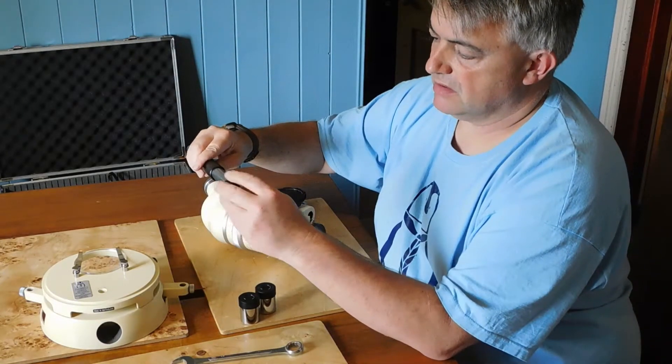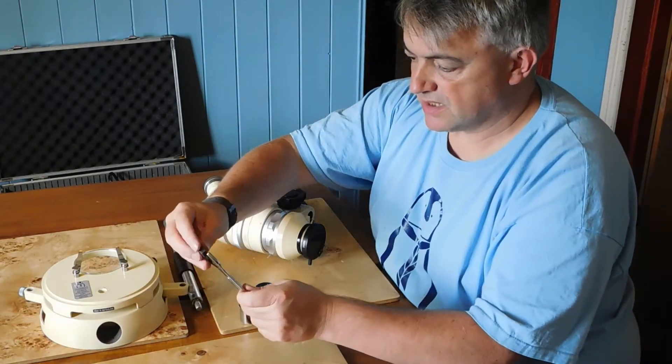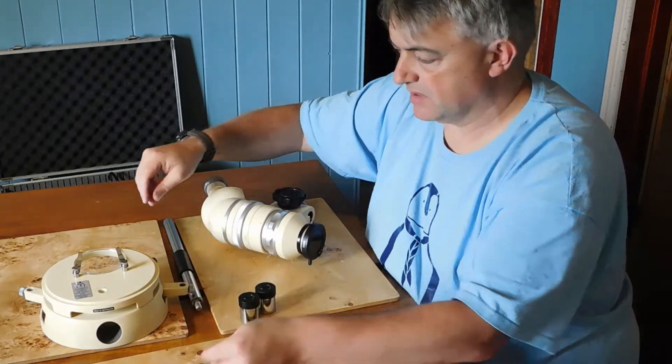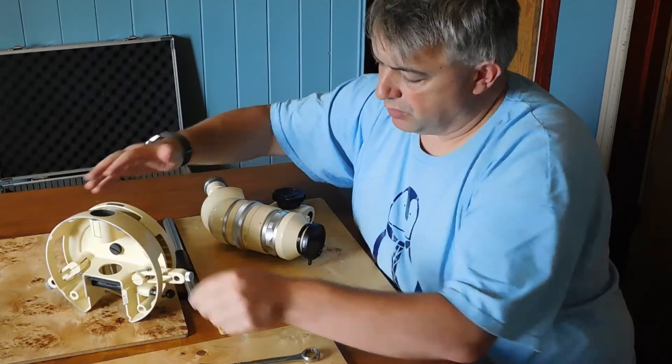So we're going to take the nut off the end of the post. That nut is actually going to sit in the open end of the spanner — the correct spanner for this nut is in the box.